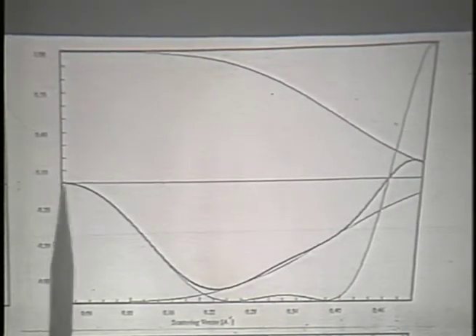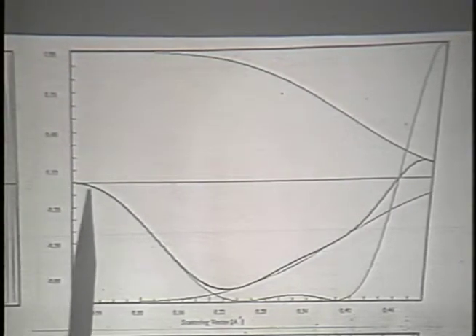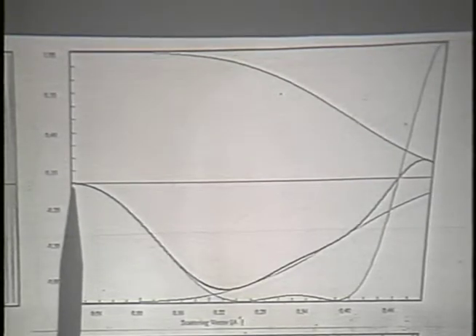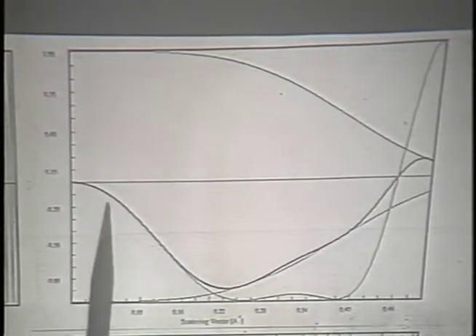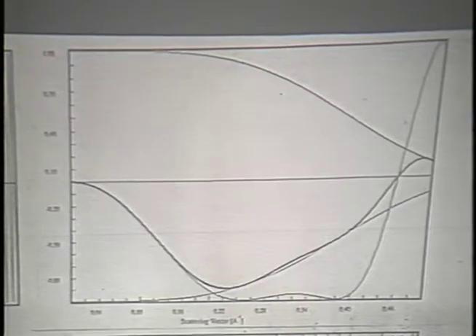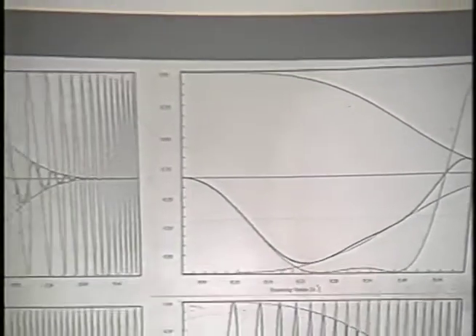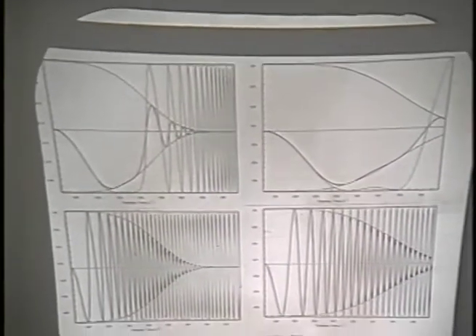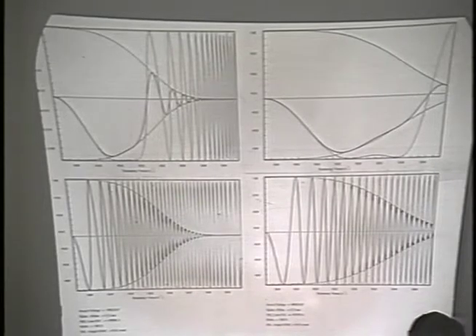Now, this part of the curve in here is probably what's more interesting to most of the people here, where you're looking at objects that may be on the size of 10 or 100 angstroms or even larger. The fact that the curves in both cases are very close to 0 means that those very large spacings have very low contrast in the image. I think it was Eileen mentioned images taken at 20 microns under focus. This is the kind of defocus that's required to get good contrast at very low spatial frequencies or very large objects.